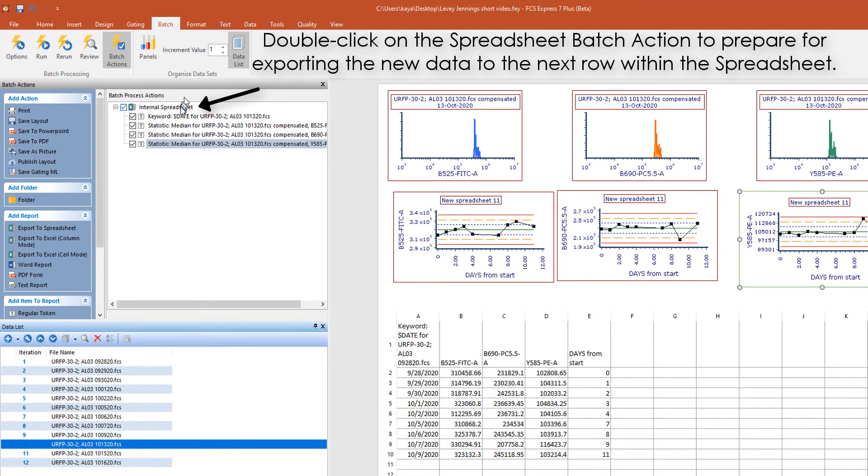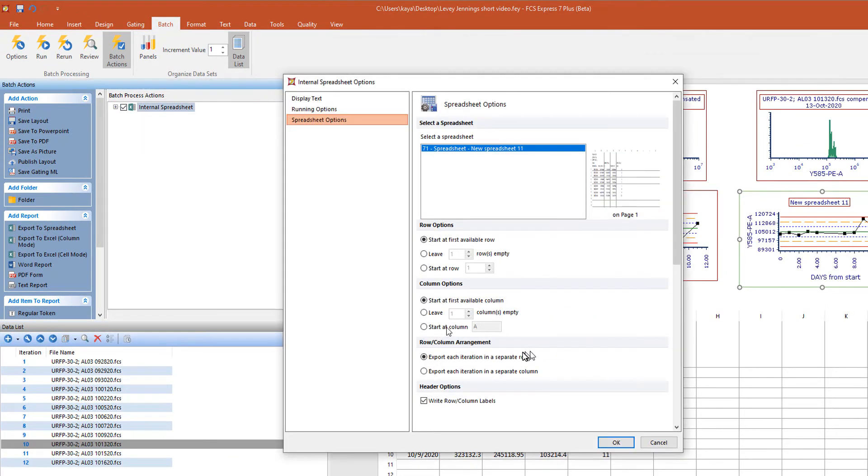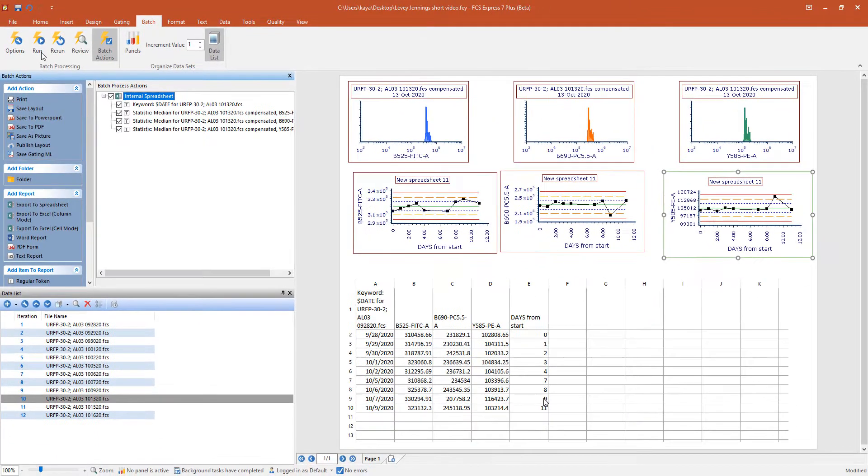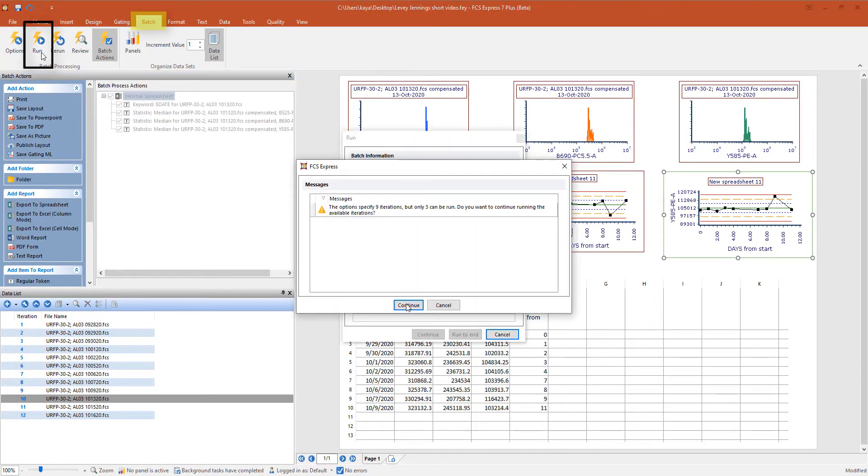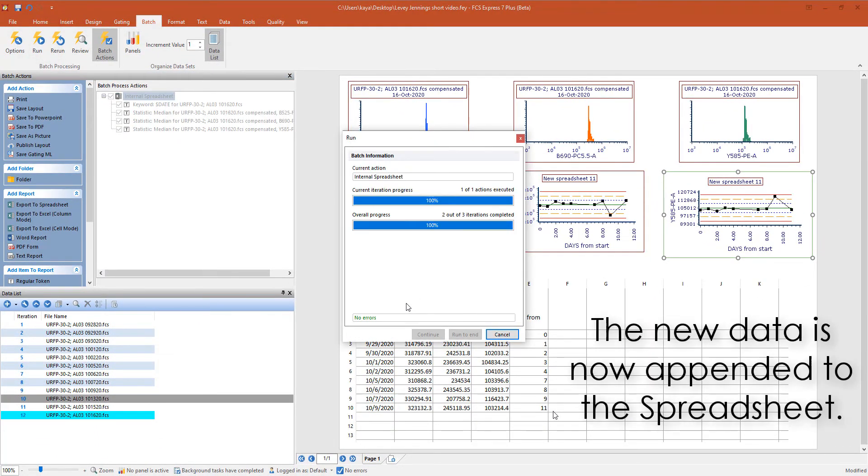Double-click on the spreadsheet batch action to set it up to receive new data. Click on Start at Column A and uncheck the Write Row Columns Labels box. Click Batch Run. The data from the new files has now been written to the spreadsheet.